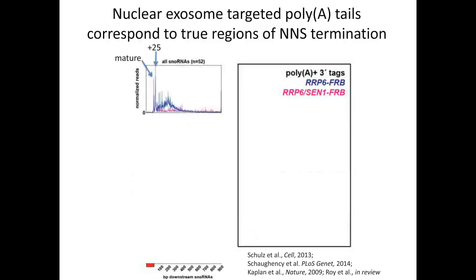So at first, if we look at the signal upon the depletion of Rrp6, we can see the mature poly-A tail peak, the plus 25 nucleotide peak, and the peaks that we're really interested in are the ones downstream that are representative of the termination site. So if we inactivate the termination mechanism in combination with the nuclear exosome inactivation, we can do that by depleting the Sen1 subunit as well. So when we deplete the Sen1 subunit, we see a loss of these termination peaks. However, the mature peak and the plus 25 nucleotide peak do not go away, and that confirms that these indeed are not termination sites, but rather the processing sites.